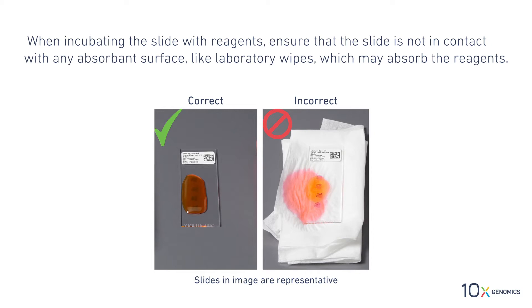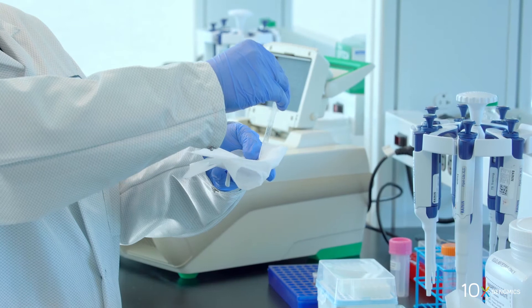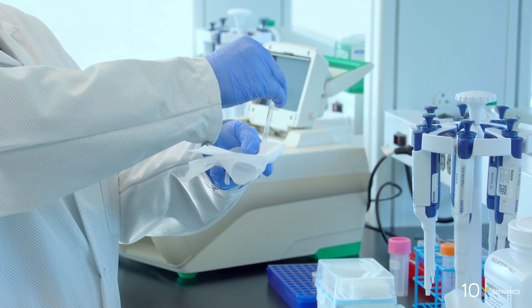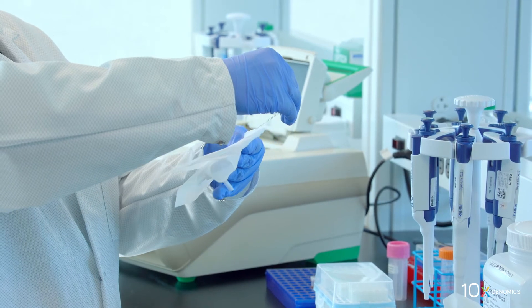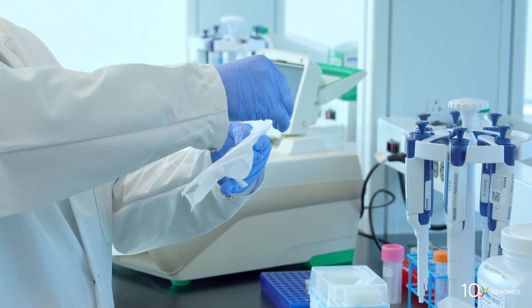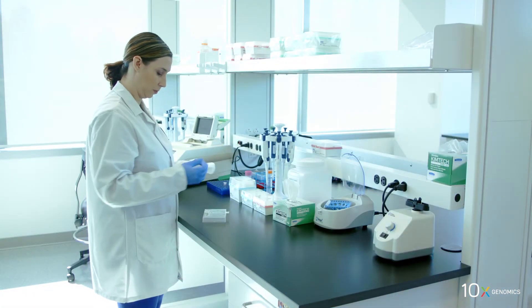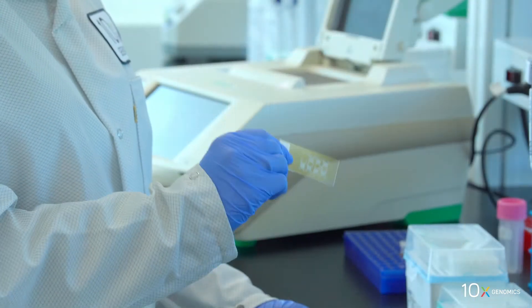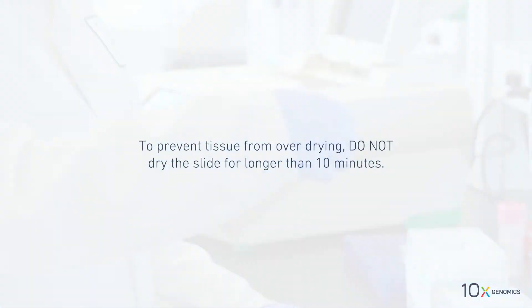Like laboratory wipes, which may absorb the reagents. Discard the reagent by draining and/or holding the slide at an angle with the bottom edge in contact with the laboratory wipe. Wipe excess liquid from the back of the slide without touching the tissue sections. Air dry the slide; if necessary, gently fan the slide to accelerate drying.